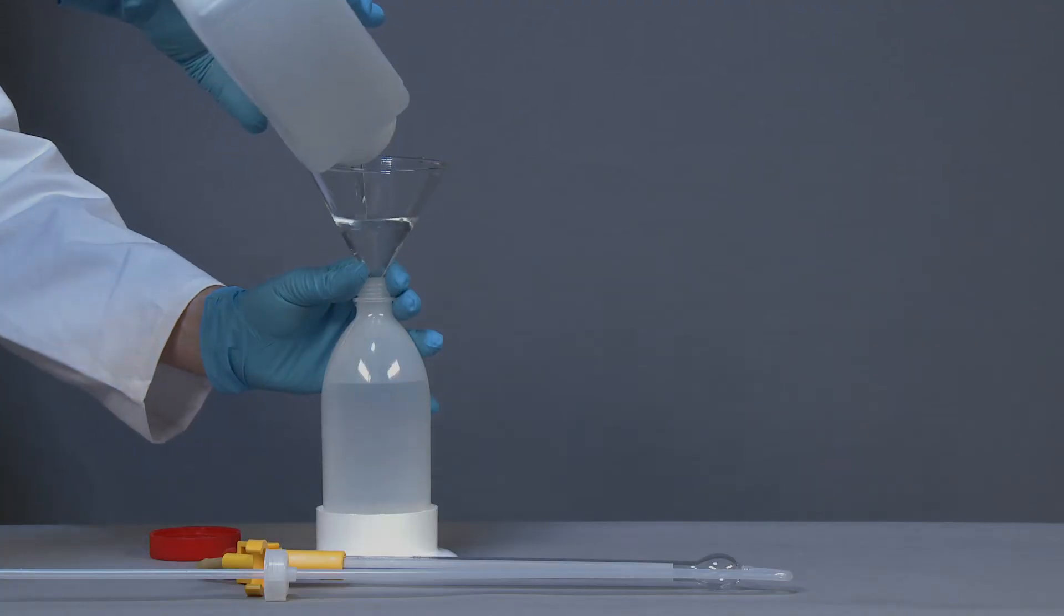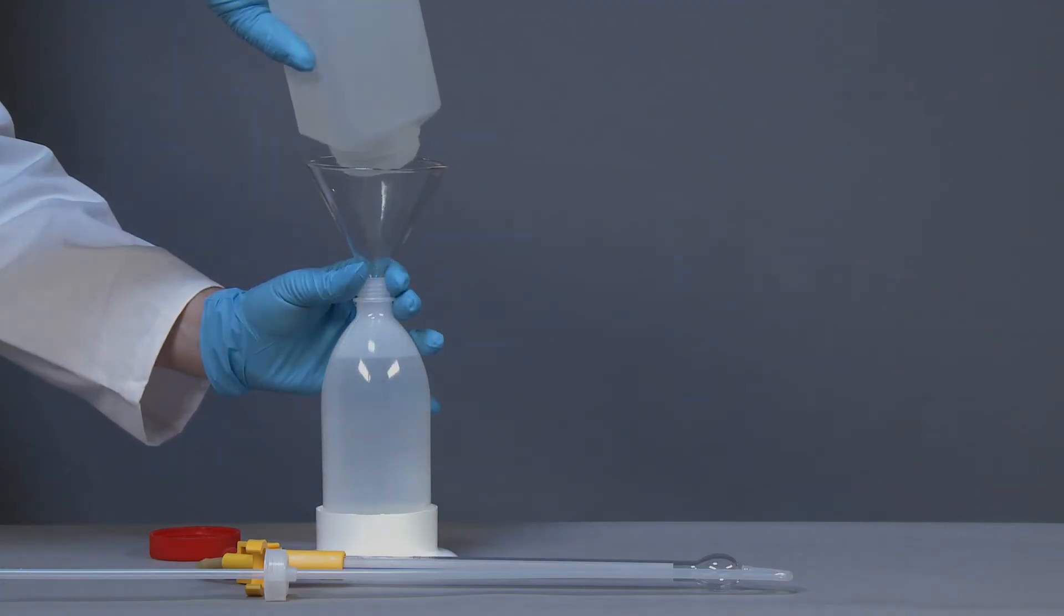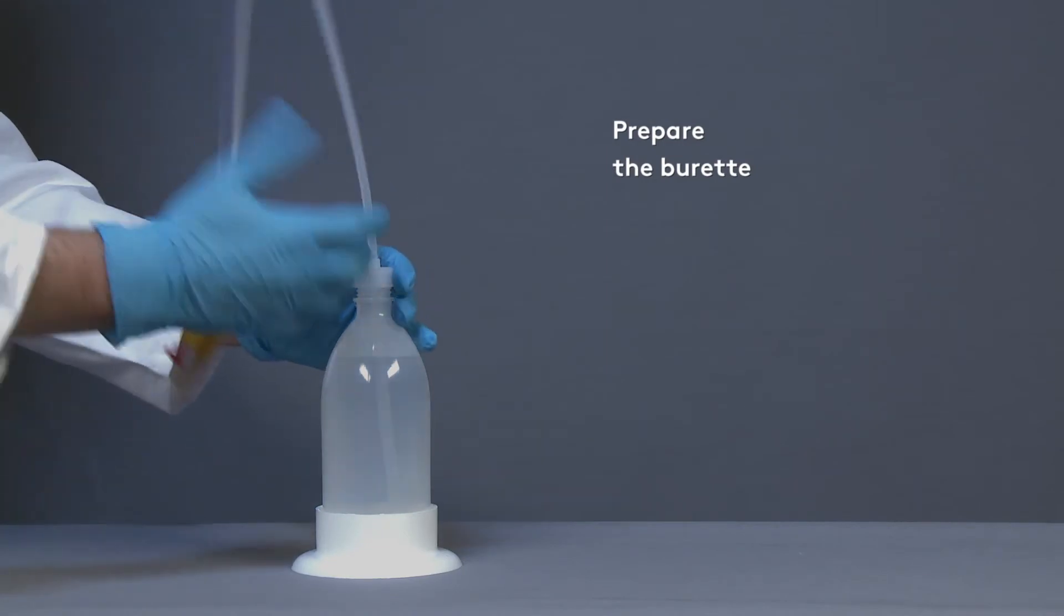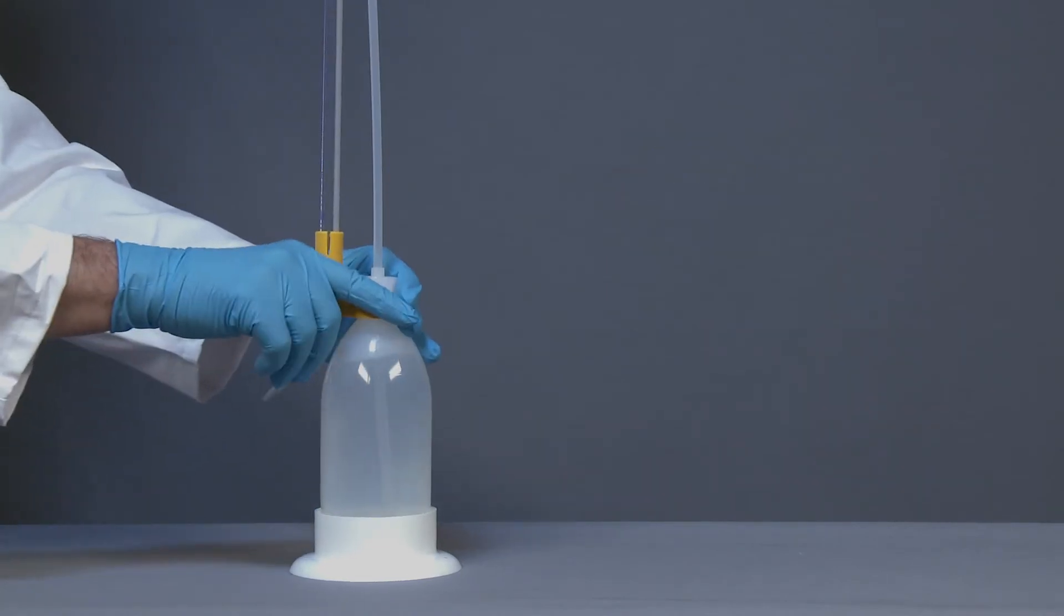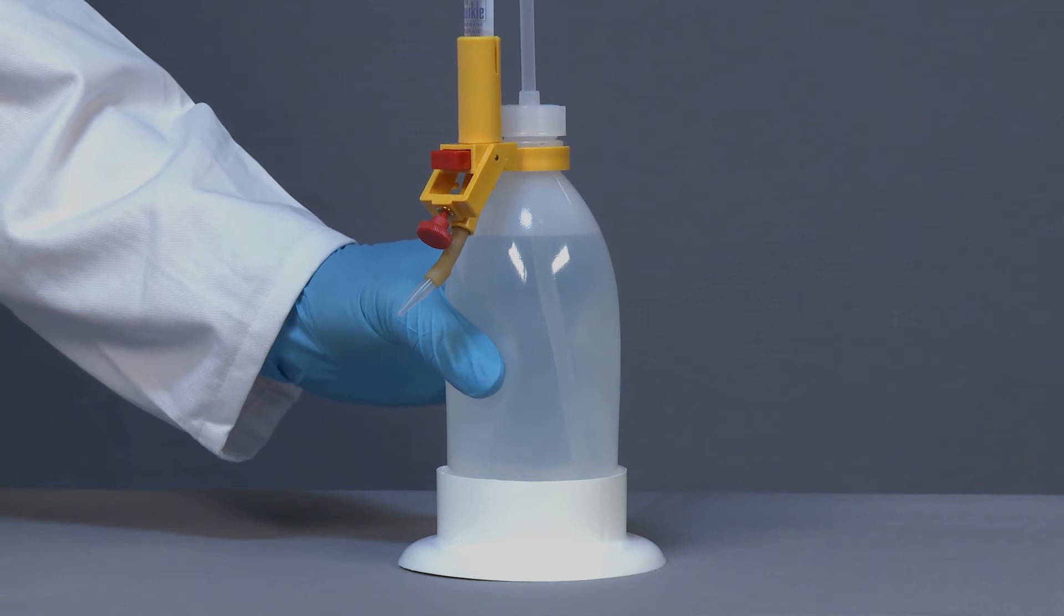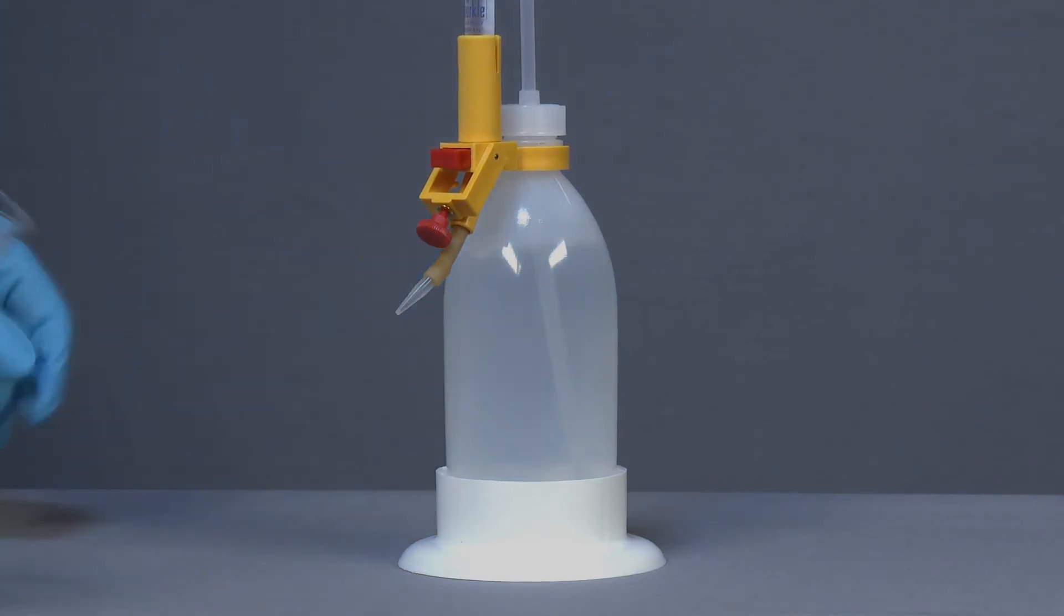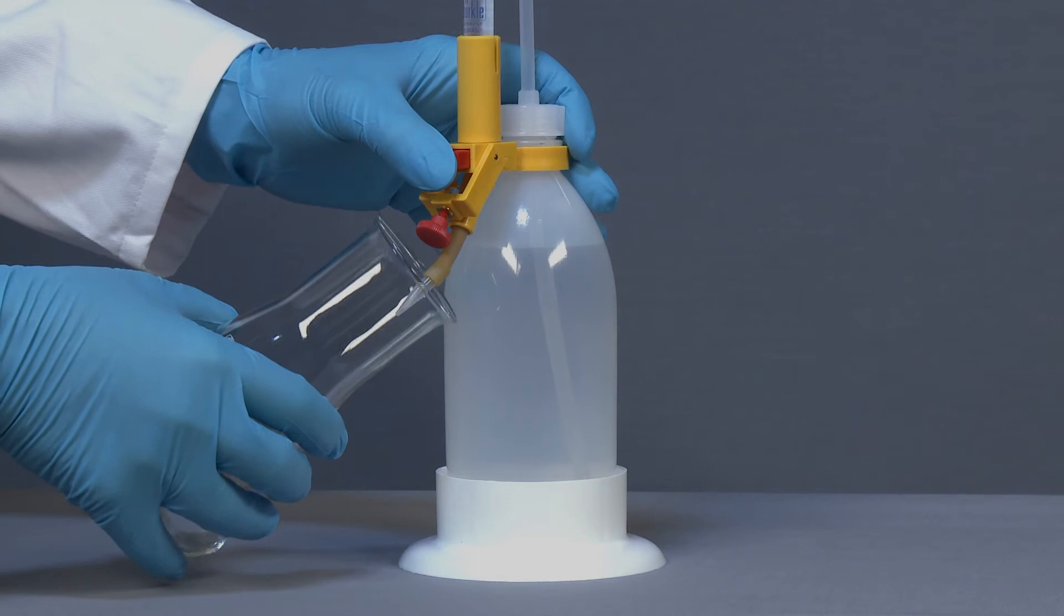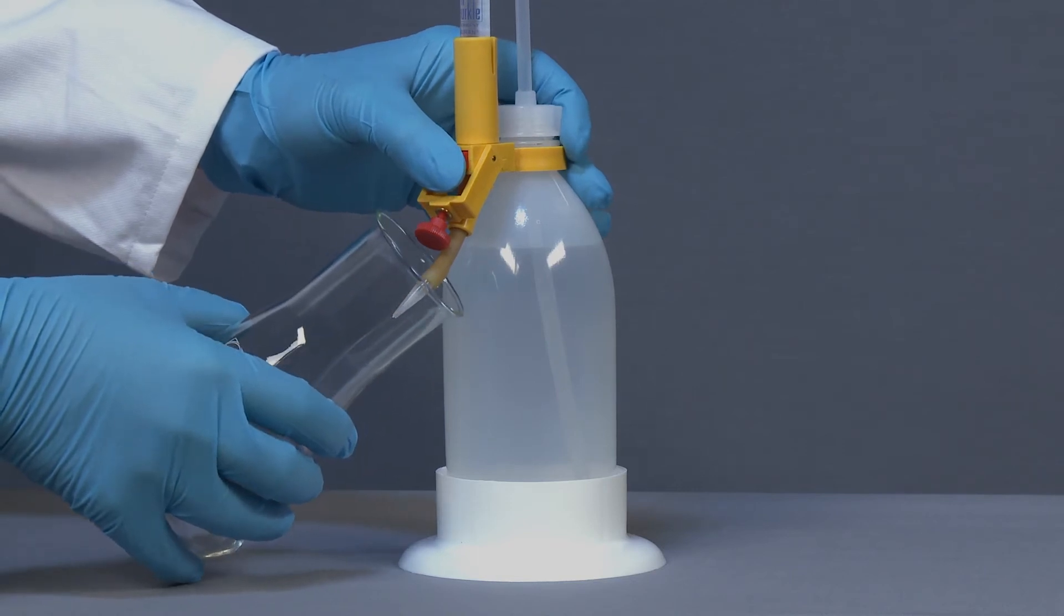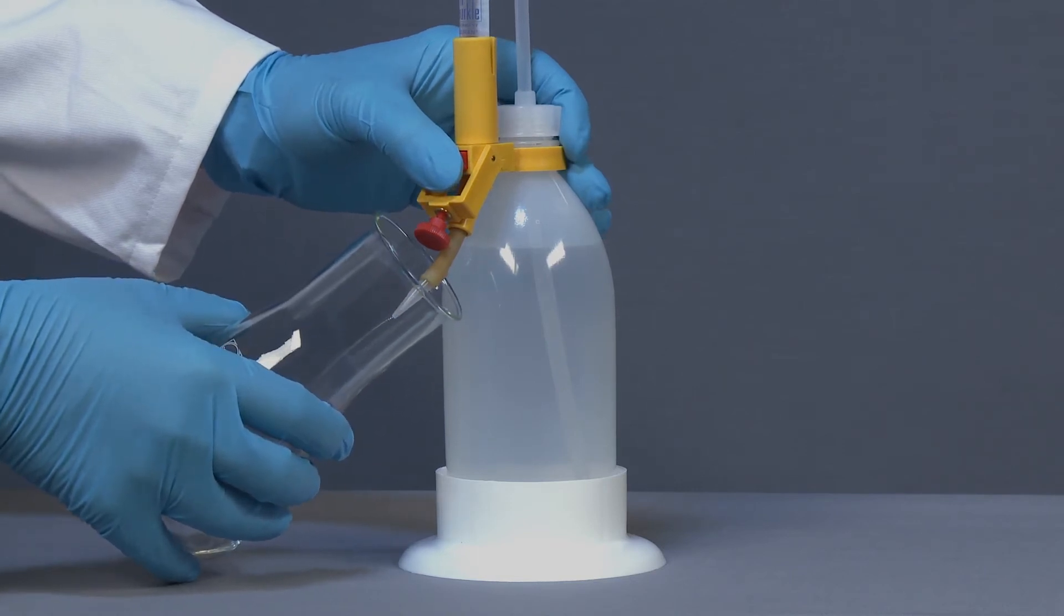First, fill the titration solution into the bottle with the aid of a funnel and then place the burette on. Firmly squeeze the bottle once to fill the burette. Then press the red button and let some liquid flow out in full stream to remove the air from the tap.